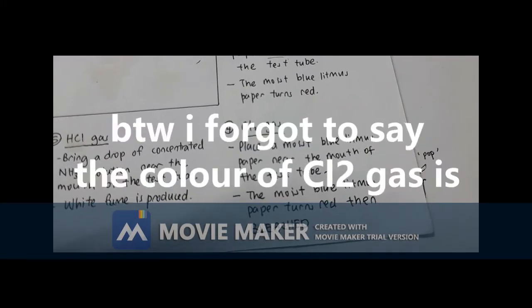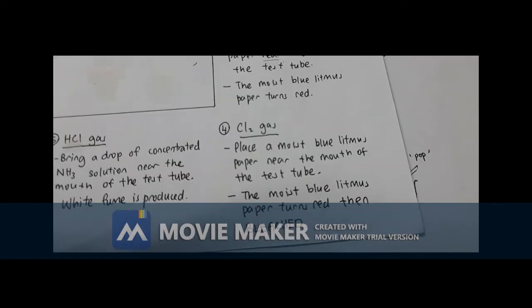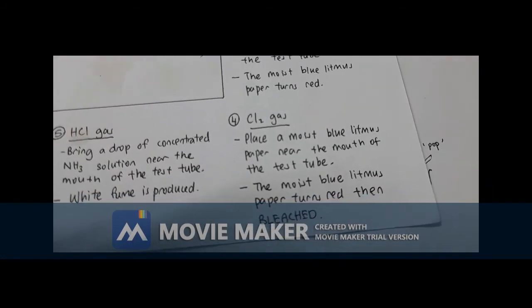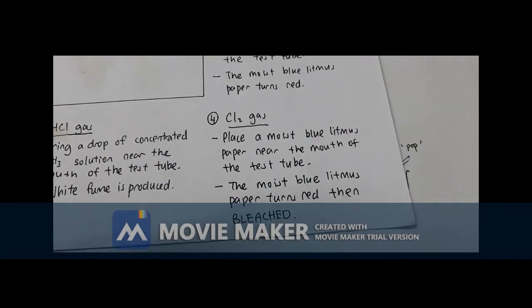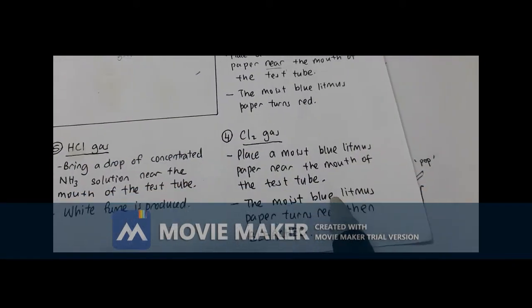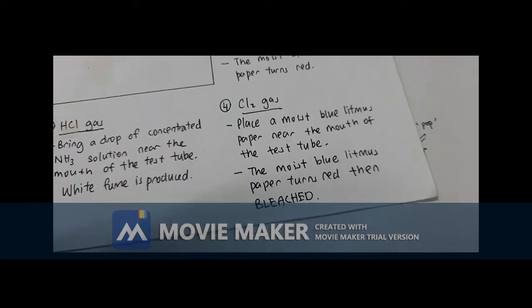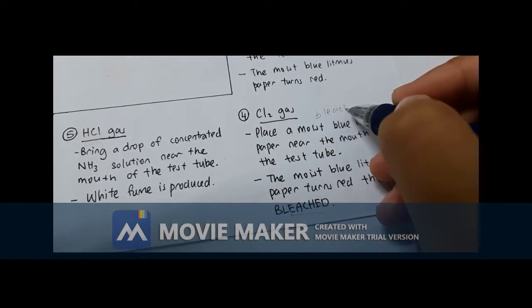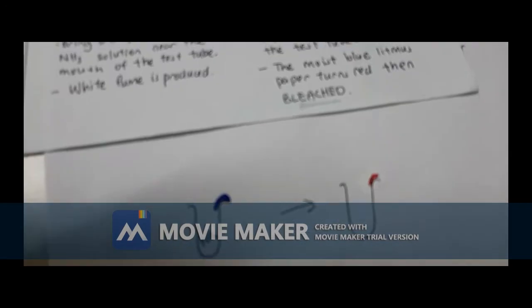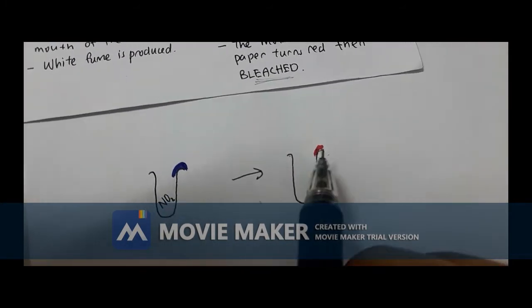Next we have Cl2 gas. Place moist blue litmus paper near the mouth of the test tube, which is the same as NO2 gas, but the result is slightly different. The moist blue litmus paper turns red, then bleached. The explanation for why it turns red is the same: it's an acidic gas and only shows its acidic property in the presence of water, so that's why we have moist blue litmus paper. And the reason why it turns bleached is because Cl2 is a bleaching agent. So it bleaches the blue litmus paper that has turned red, and then it just turns white.